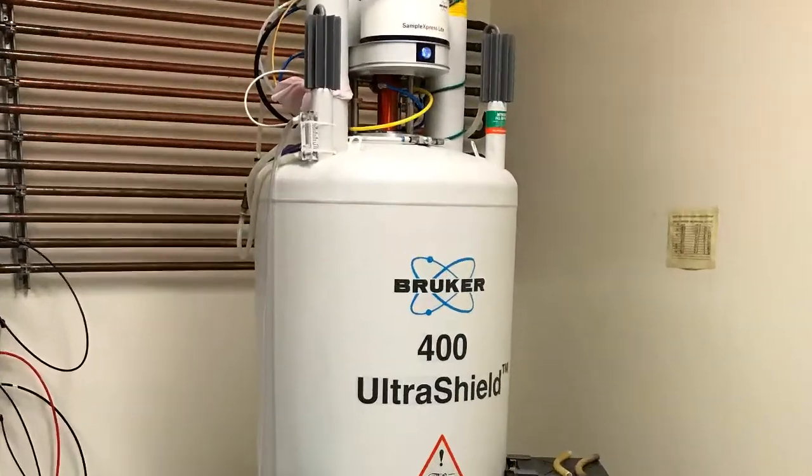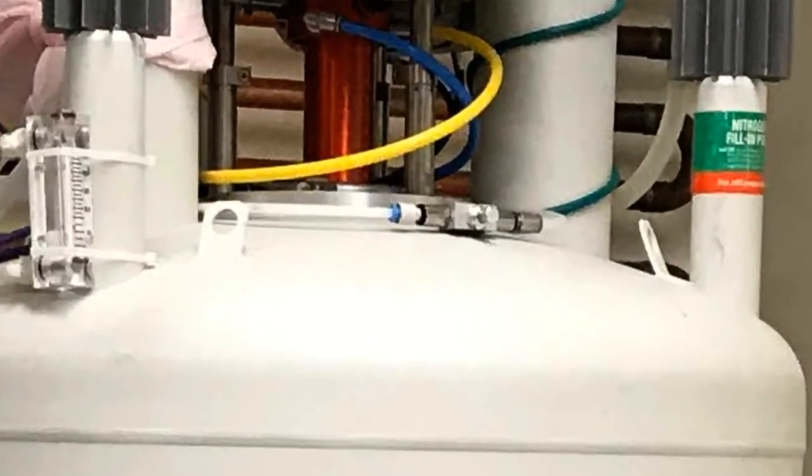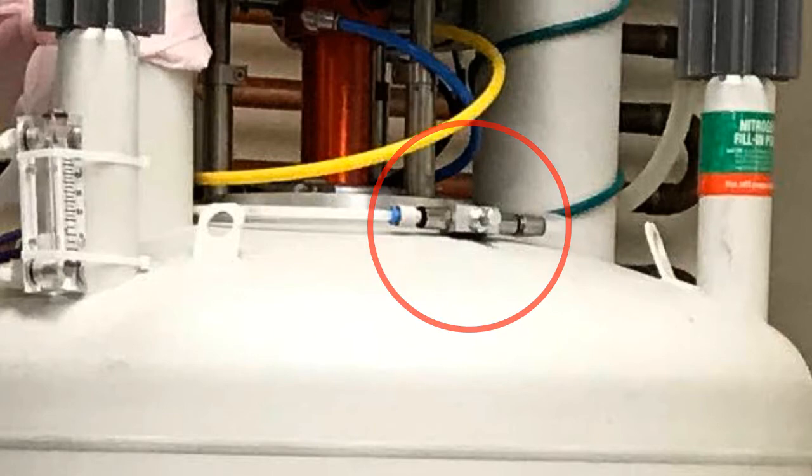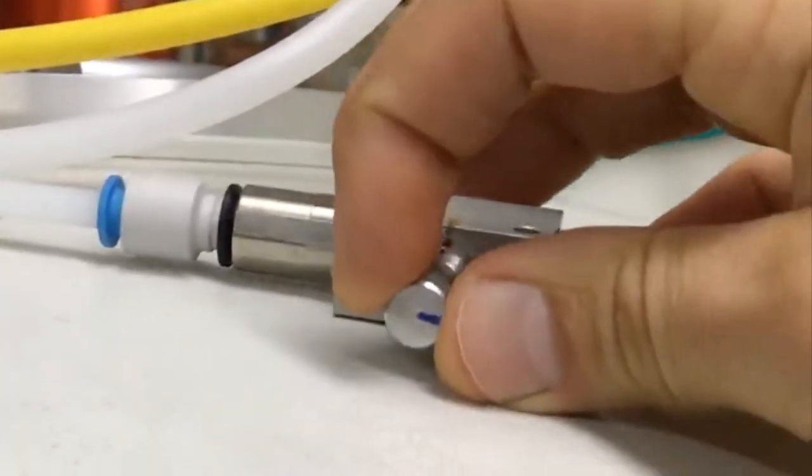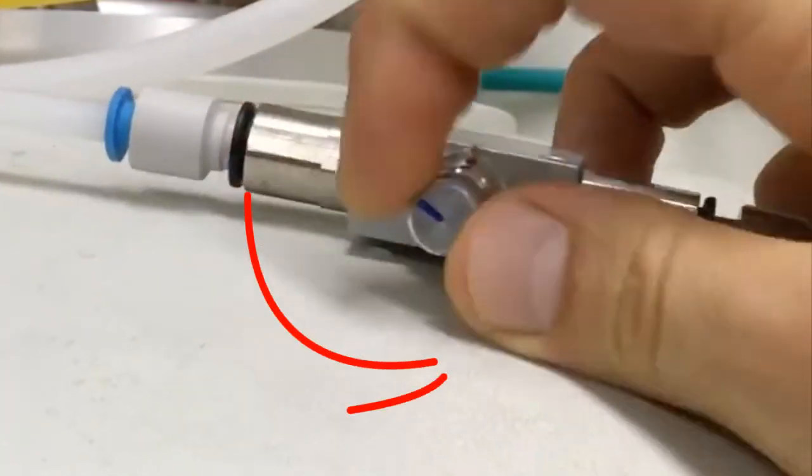The shim gas valve is located at the very top of the NMR instrument. First, check that the valve is fully closed by rotating clockwise. To open the valve, rotate counter-clockwise.